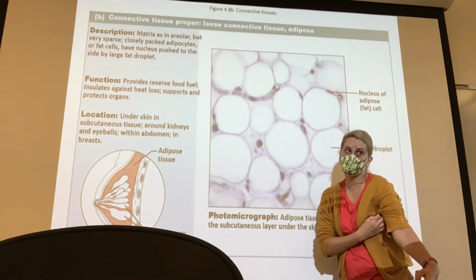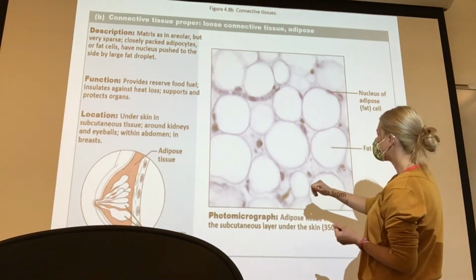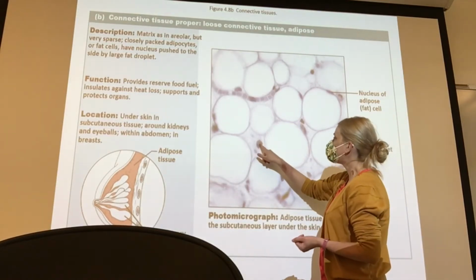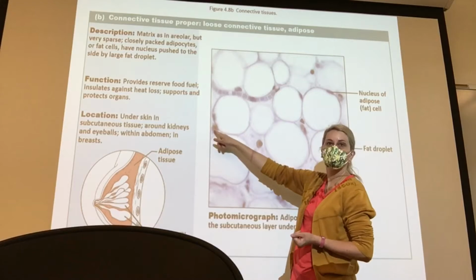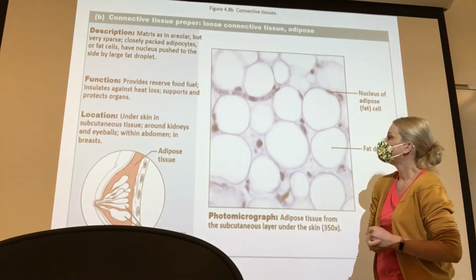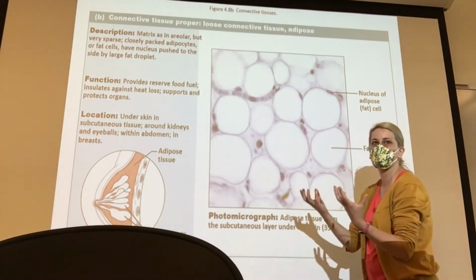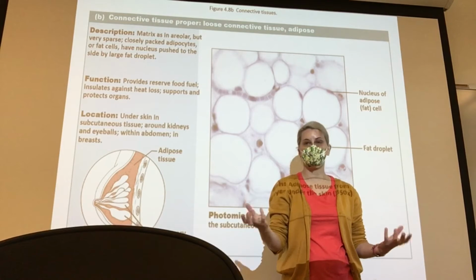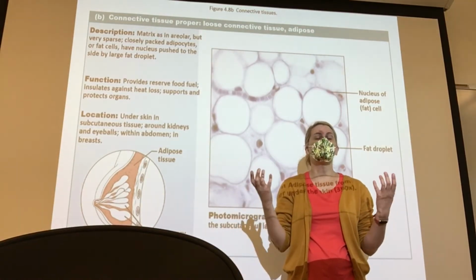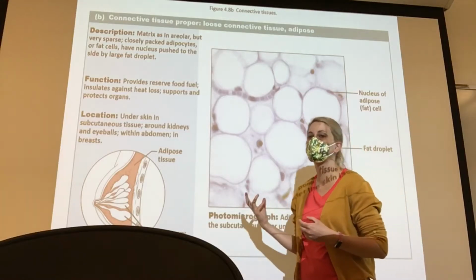We're learning more about what they do. We don't know a whole lot. Maybe I don't know a whole lot yet. I'm sure the researchers do. So in here, these are nuclei, right? That makes sense. In this case, when I tell you to identify what the fibers are doing, there aren't fibers here. So you would identify that there are no fibers. I think this is one of the easier ones to identify.